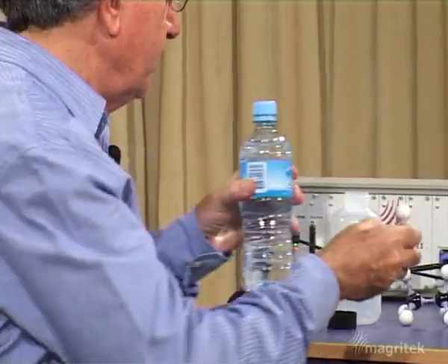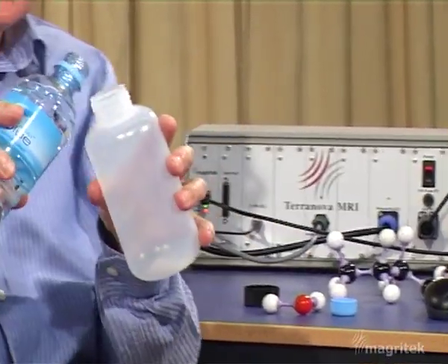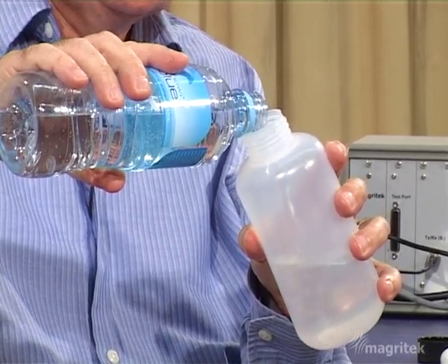So let's prepare the sample. This is the container that we're going to place inside the probe of the Terranova apparatus, and I'll just fill it up with water from this bottle.